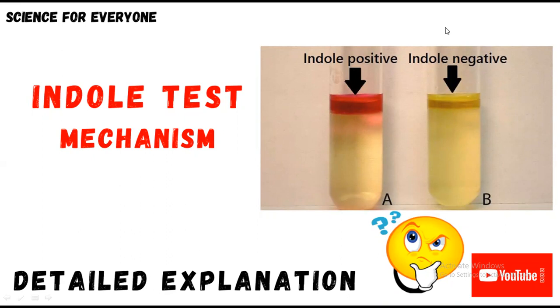Today the video is related to microbiology, and the title of my today's lecture is the Indole Test and its mechanism. Indole test is basically a biochemical test that is used to detect species of Enterobacteriaceae in a specific inoculum. It is used to test which type of bacteria is present in it. So if it is a member of the Enterobacteriaceae family, it can be detected through the indole test.